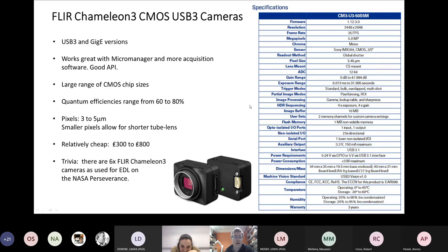What you don't get is the low noise performance. So when you're going very low light and you crank up the gain, you have a noisier background than if you'd spent a lot more money. And that's essentially it. Another difference is that you wind up getting systems with much smaller pixels. Research grade cameras usually have 10 microns or so.